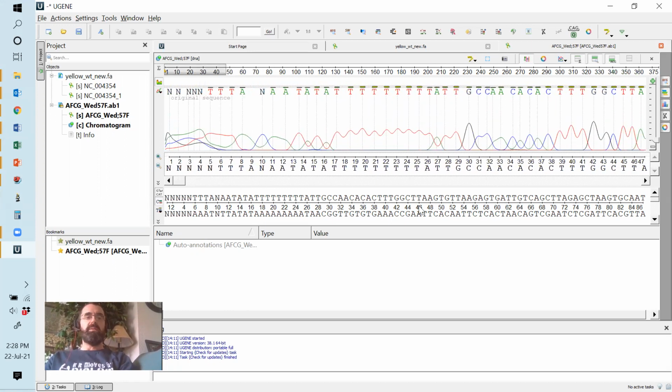But at the beginning, what happens is it's very hard to resolve itty bitty teeny tiny pieces of DNA very well. And so the very first ones that come off the capillary sequencer down that tube are the smallest because they're the ones moving the fastest. And so it's really hard to resolve those. So for the first few, until you get reasonably sized chunks, you get really poor quality sequence. So all of this is not really any use, right? So we just discard all of this.